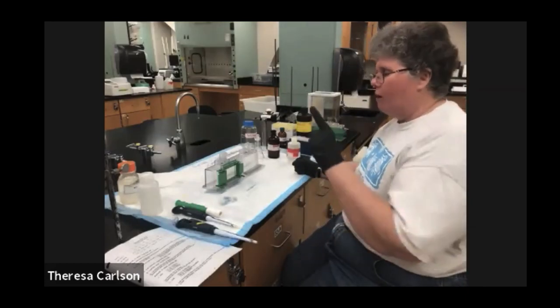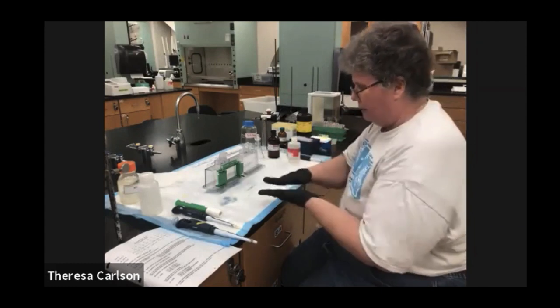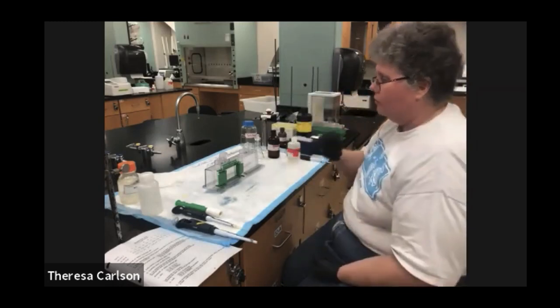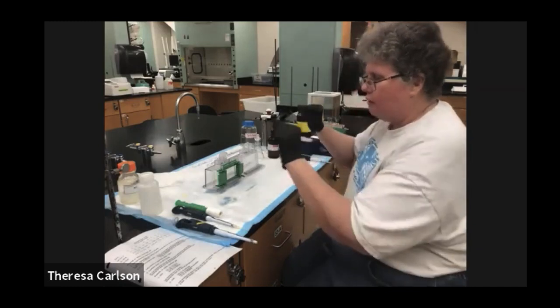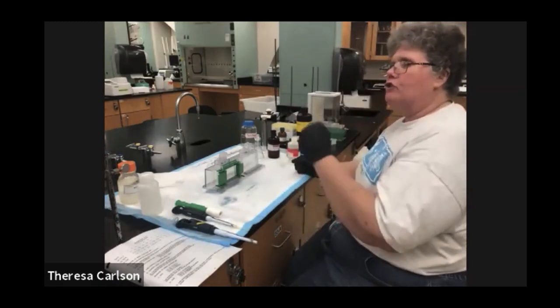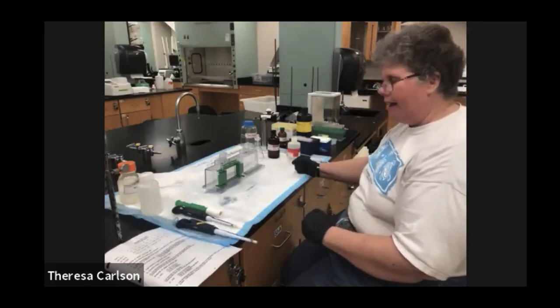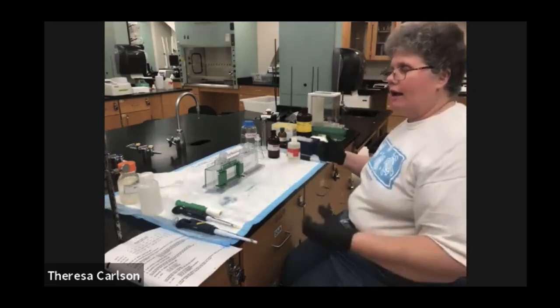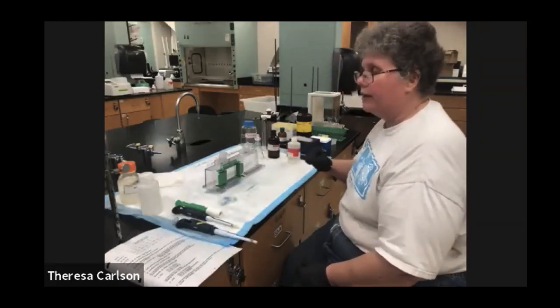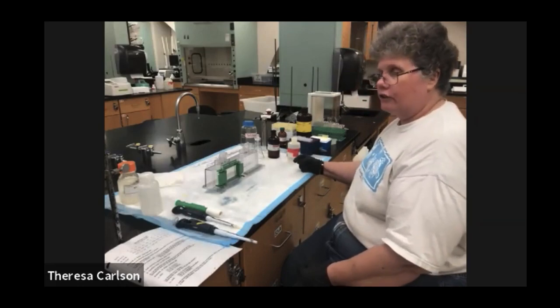Make sure you watch the video on the theory of what's happening in this SDS-PAGE gel so that you can get a better understanding of that. But in the stacking gel, basically, your proteins are being stacked into a smaller and smaller line until eventually they're a tiny little straight line when they enter the resolving gel. And in the resolving gel, again, they're able to separate out according to their molecular weight. So the smaller pieces go through the gel faster, and the larger kD size proteins take longer to go through the acrylamide gel. You also have the two different pHs, and again, make sure you understand the purpose of those two pHs. I cover that in the gel theory section.